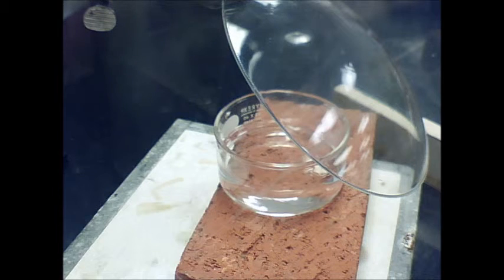What's the symbol for potassium? K. You need to write down that we're working with potassium now, okay? We're going to do the same thing. And let's get a small piece of potassium. I can get it out.